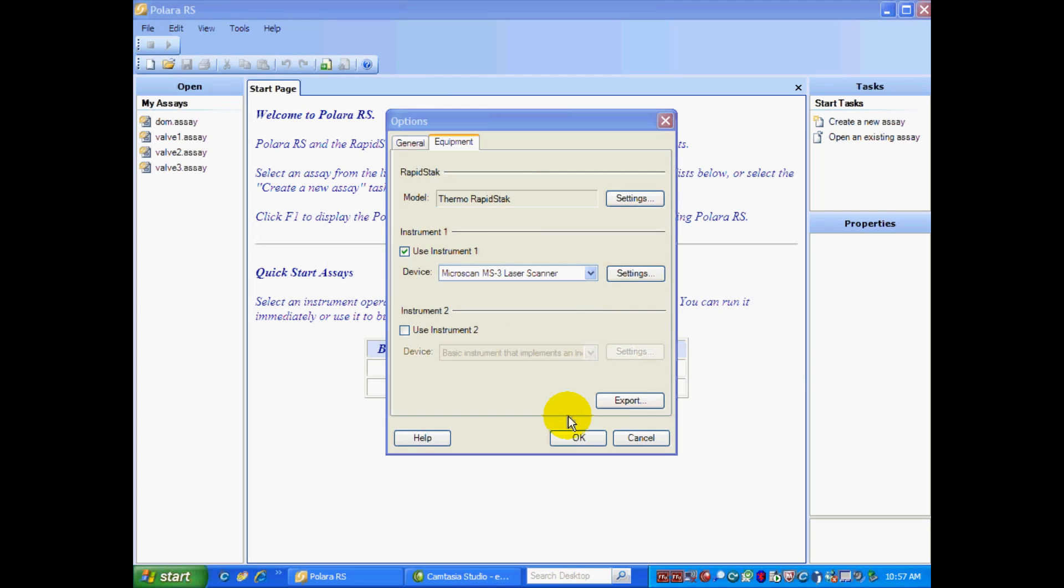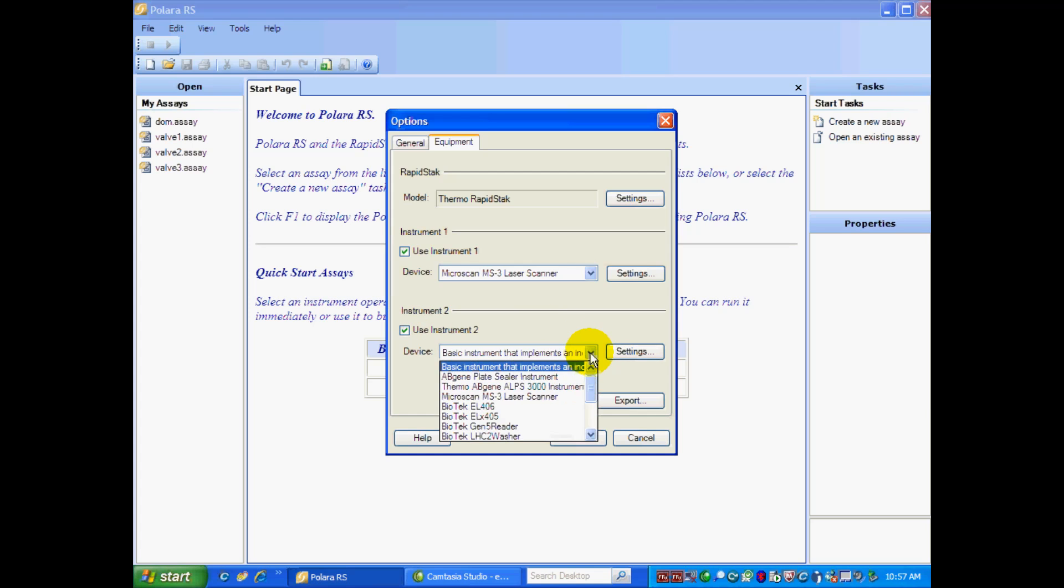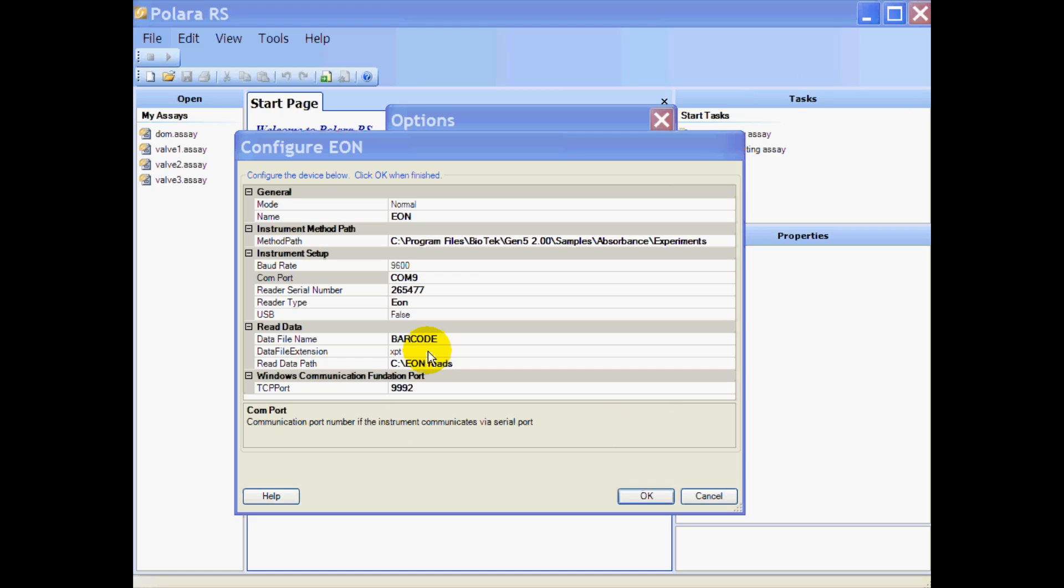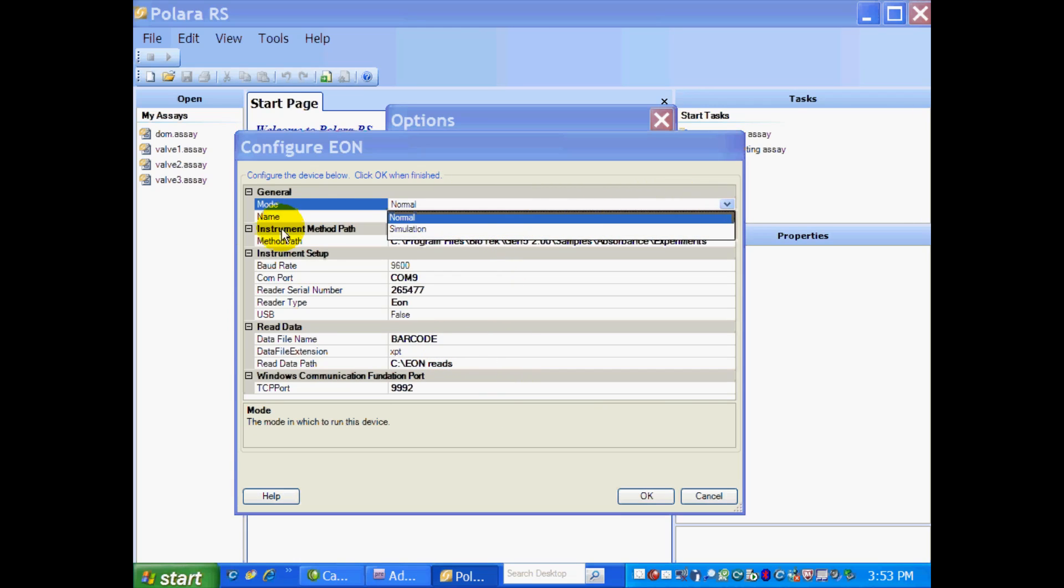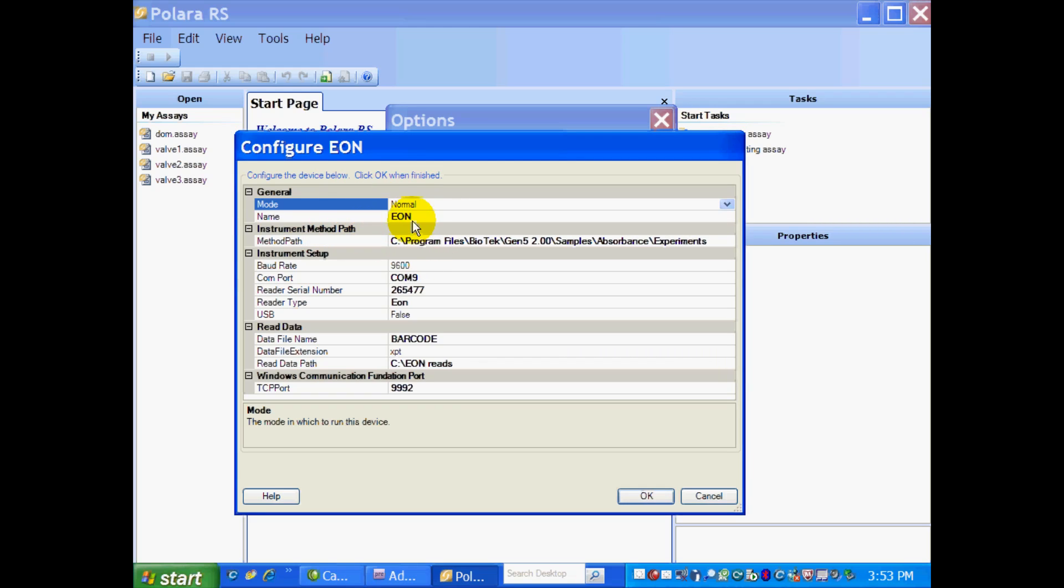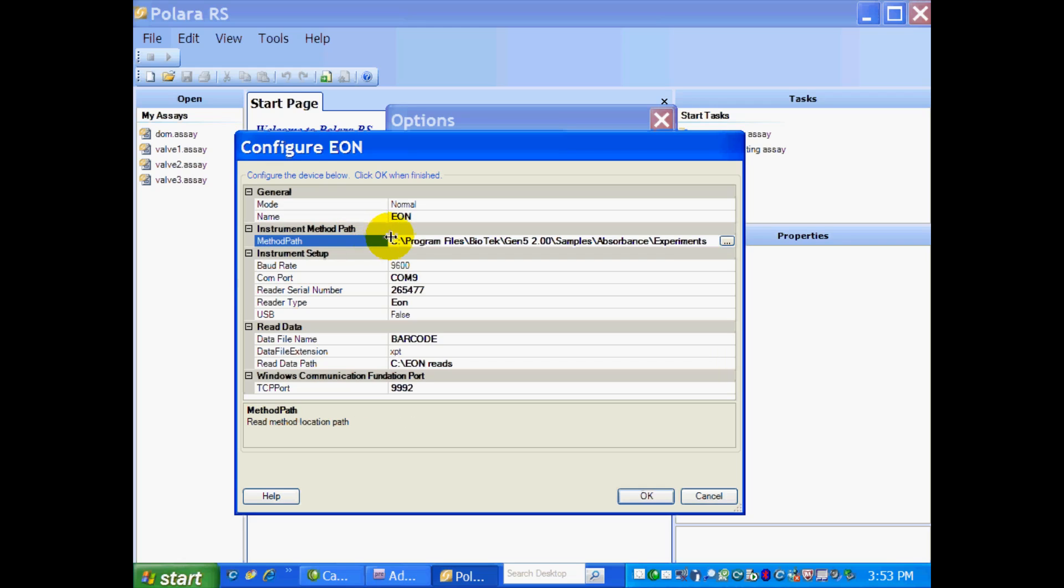Next, we need to select the checkbox, Use Instrument 2. And from the drop-down, we need to select our driver. And our driver is going to be the BioTek Gen5 reader. So just like with the other instruments, we have to configure our Eon. So again, we want our mode set to Normal. We have to give our instrument a name. So I just gave it Eon. And you have to identify the method path. So this is the path where I have all my experiments saved.